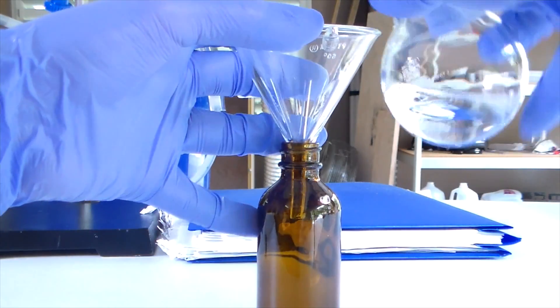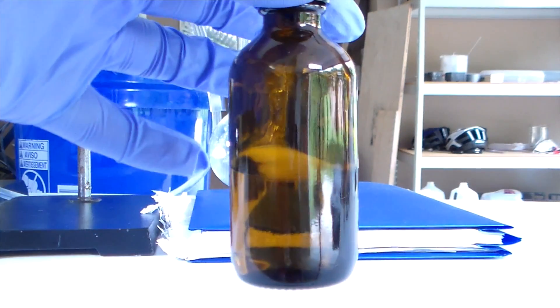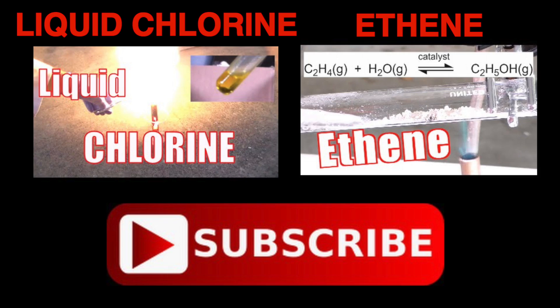Anyway, the product was transferred to a glass bottle for storage. Well, that's it for this video.